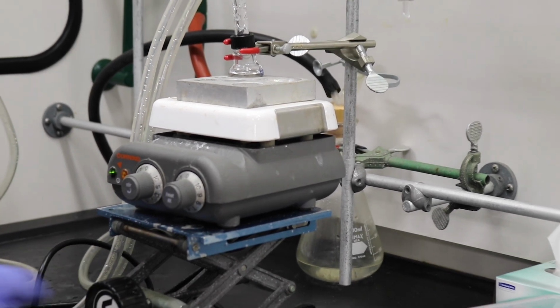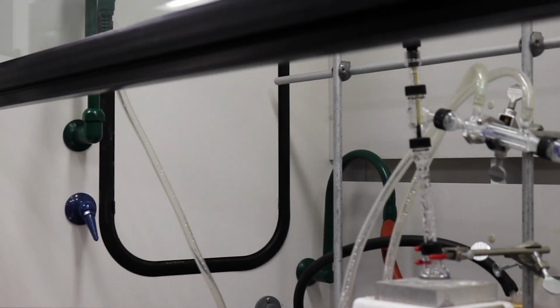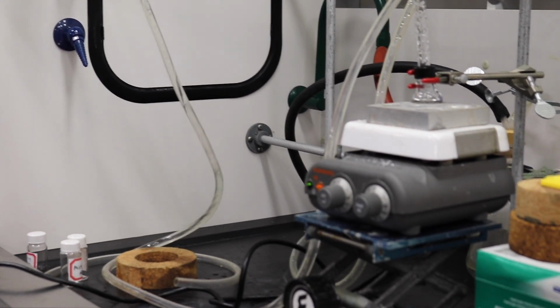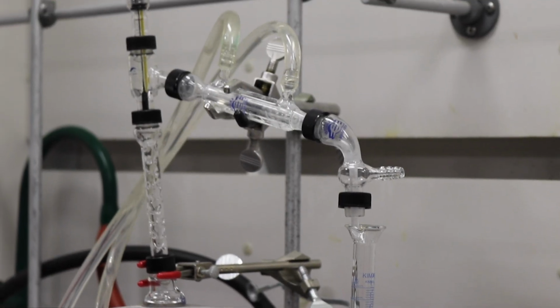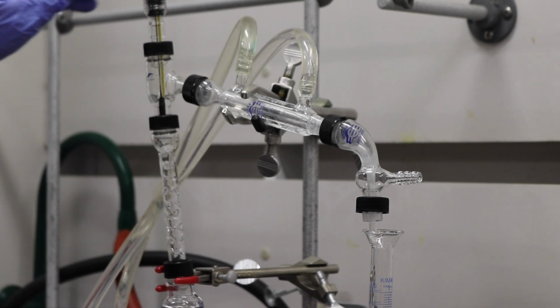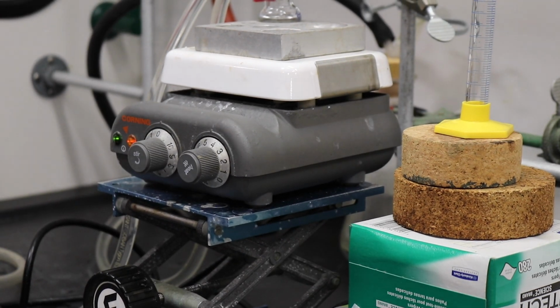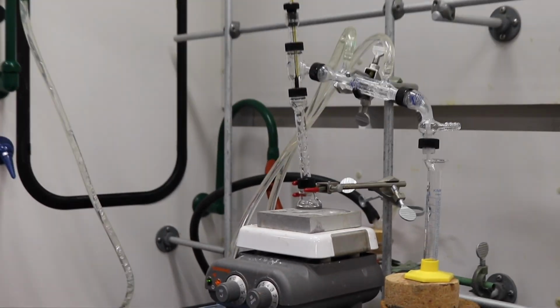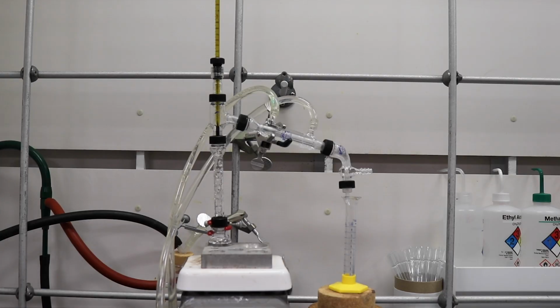Now we're turning the water on, making sure the water is flowing through. We can't forget that step. So the water now is flowing through. And now we turn on the heat after the water. And now we're just going to, again, wait for the system for the liquid to boil.